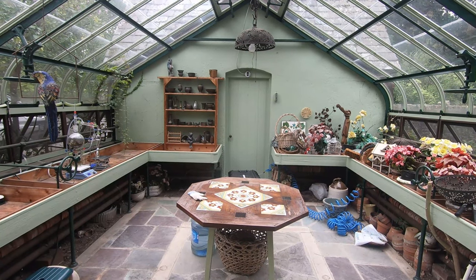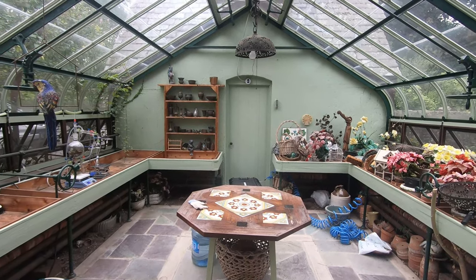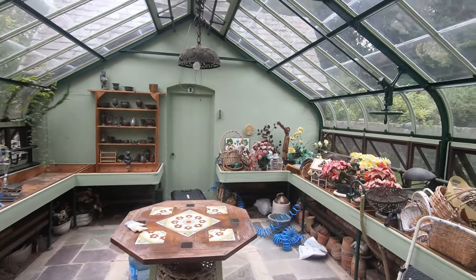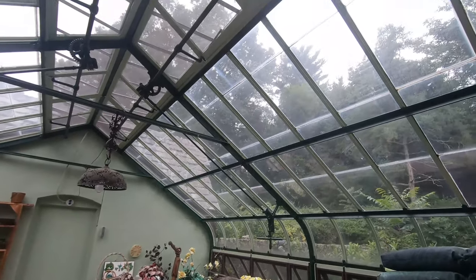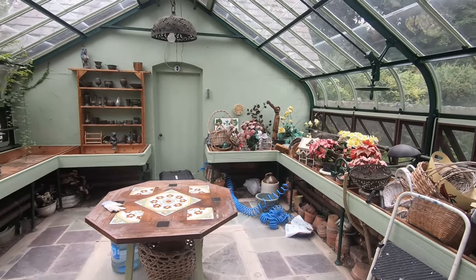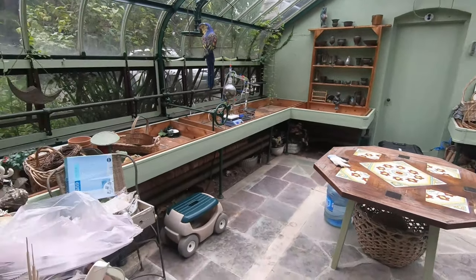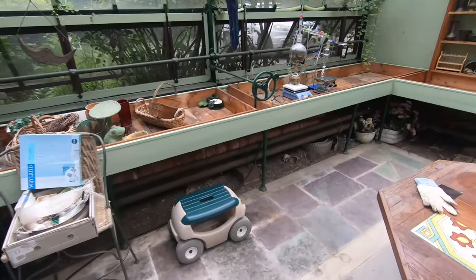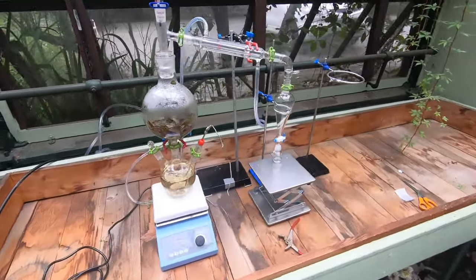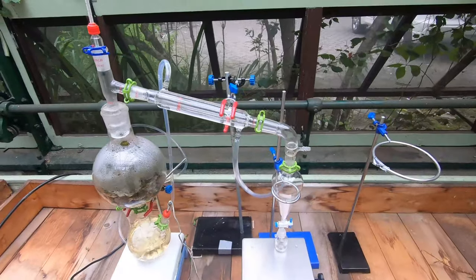Welcome to the greenhouse — this is where I've been able to set up my lab for the short amount of time that I'm here. This place was built in the 1920s, so you don't really see stuff like this much anymore. Let me show you my lab setup now.